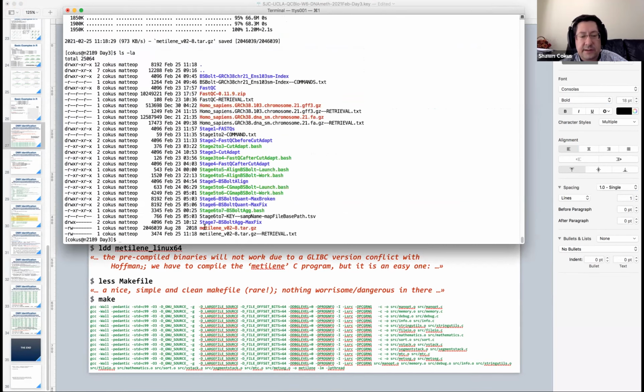Okay, and there is a tar gz file, which is basically a zip file, but it's the Unix-y zip file. It's a gzipped tar archive. Tar comes from probably before some of you may have been born. Tar is a very, very old programming file format. But it originally stands for tape archive.